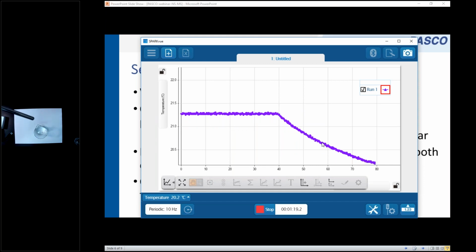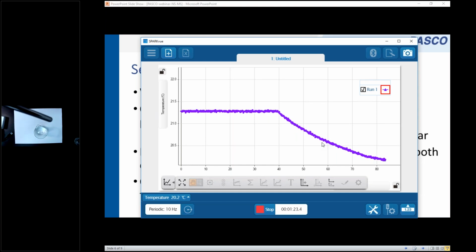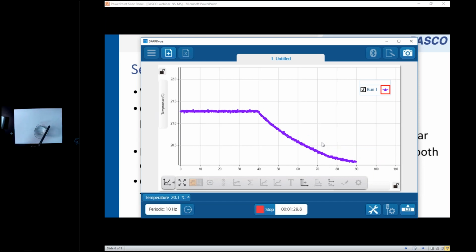And you probably can't see, I'm going to bring the probe up to the camera. It's wet on the end. Okay, I'm going to take a paper towel and dry off the end of the probe. And I want you to watch temperature change as I do that. So I'm drying it. I dried it off. It's dry now, and look what temperature did.